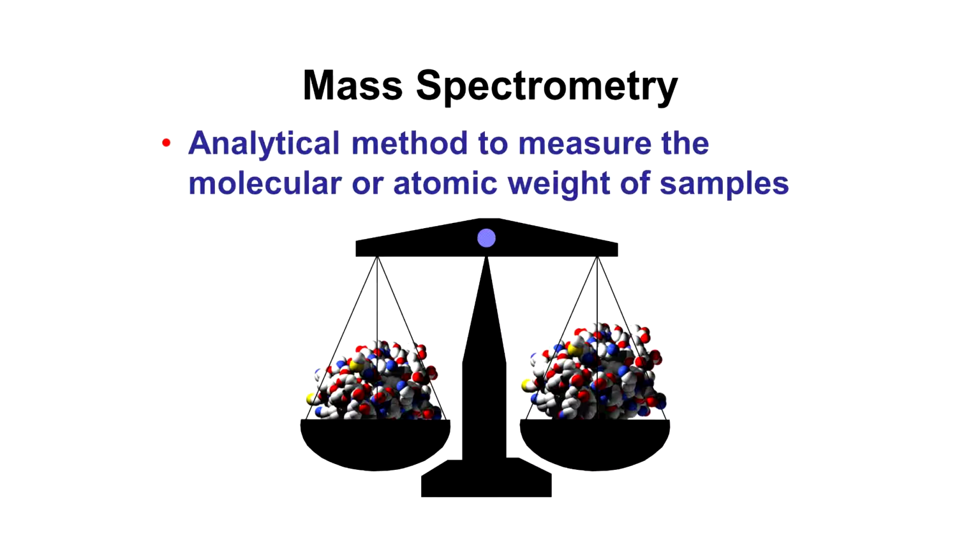So whether it's liquid chromatography or gas chromatography, ultimately you have to detect what comes out. Otherwise, they're just sort of pushing stuff into the drain or into the atmosphere. So what we do is we attach them to mass spectrometers. This is, in fact, the most common method for doing metabolomics, attaching it to a mass spectrometer. And mass spectrometry, at least relative to NMR spectroscopy, is simple because all you're trying to do is weigh things.